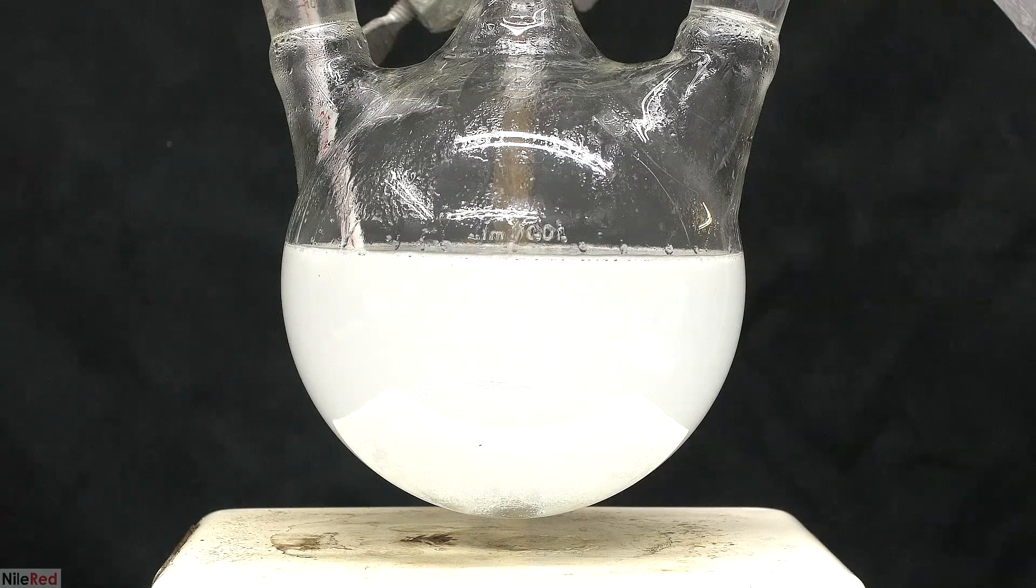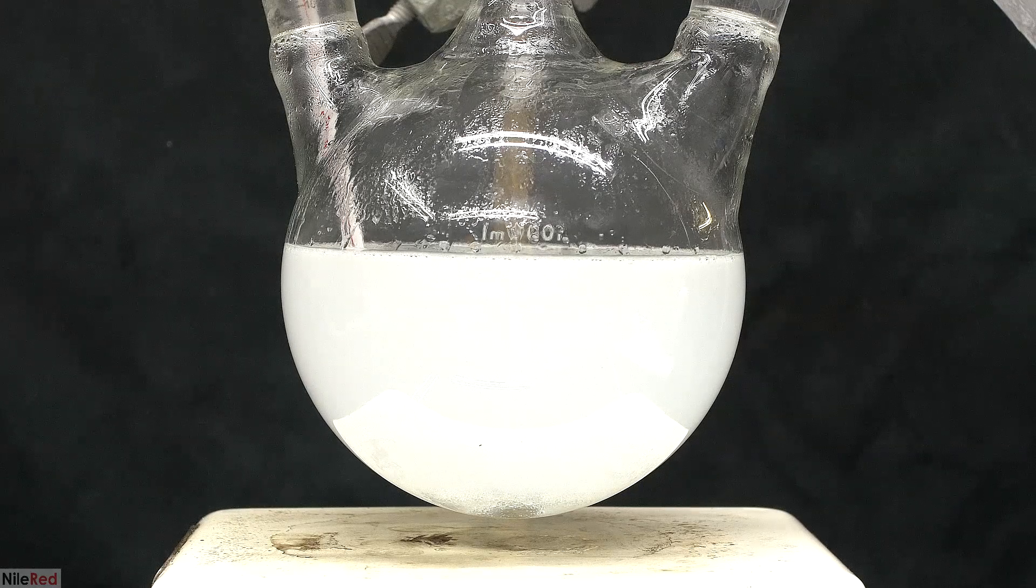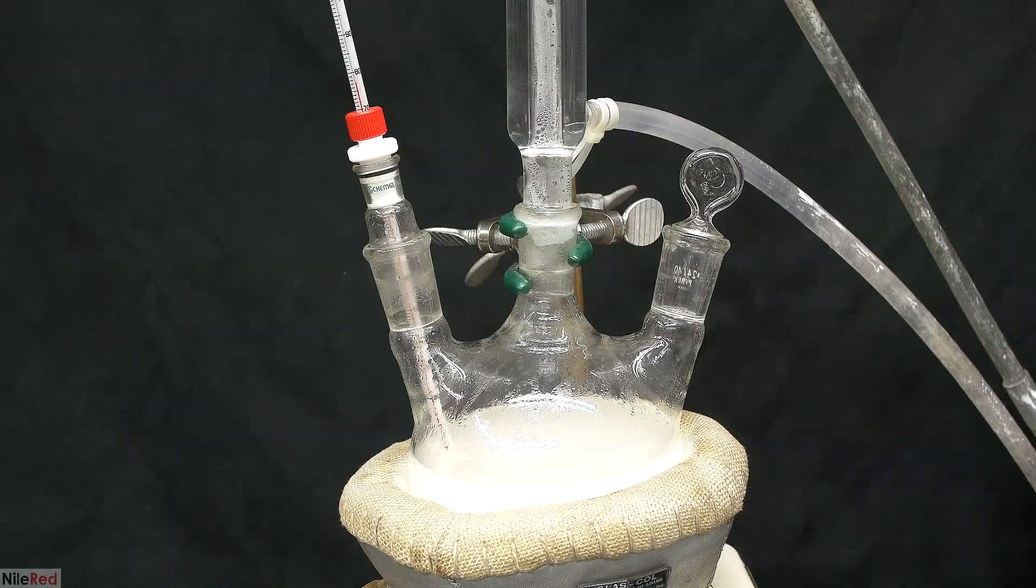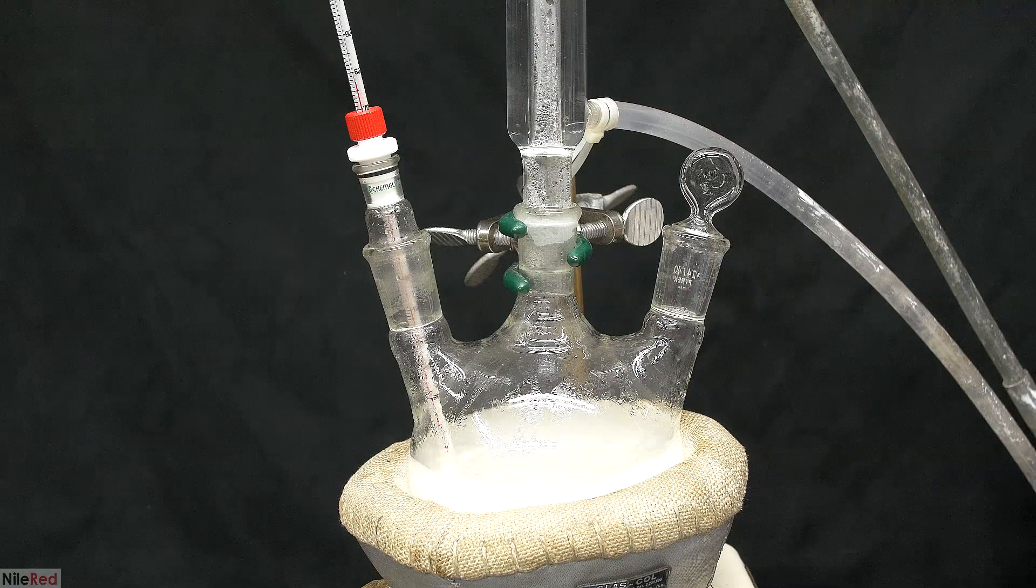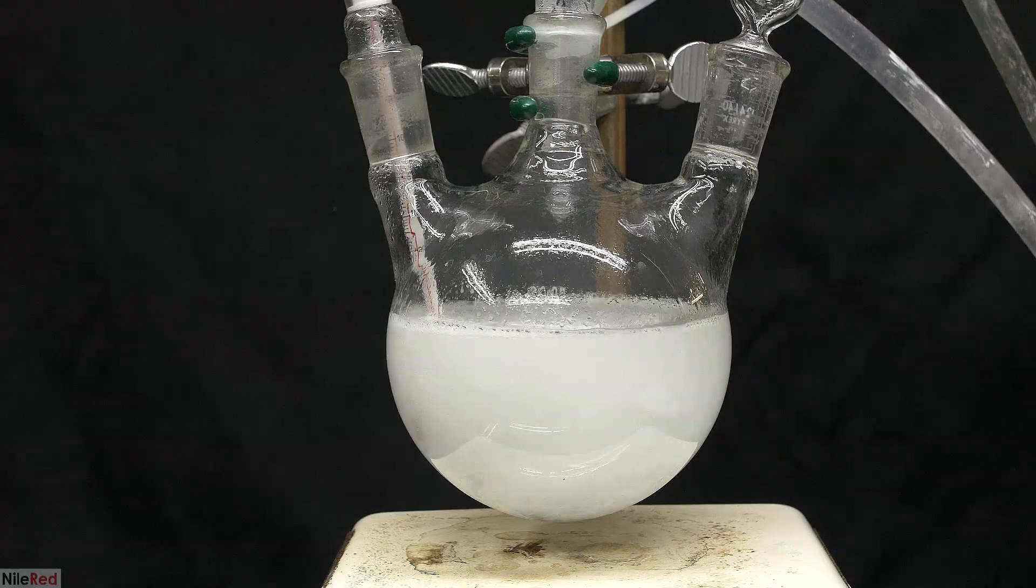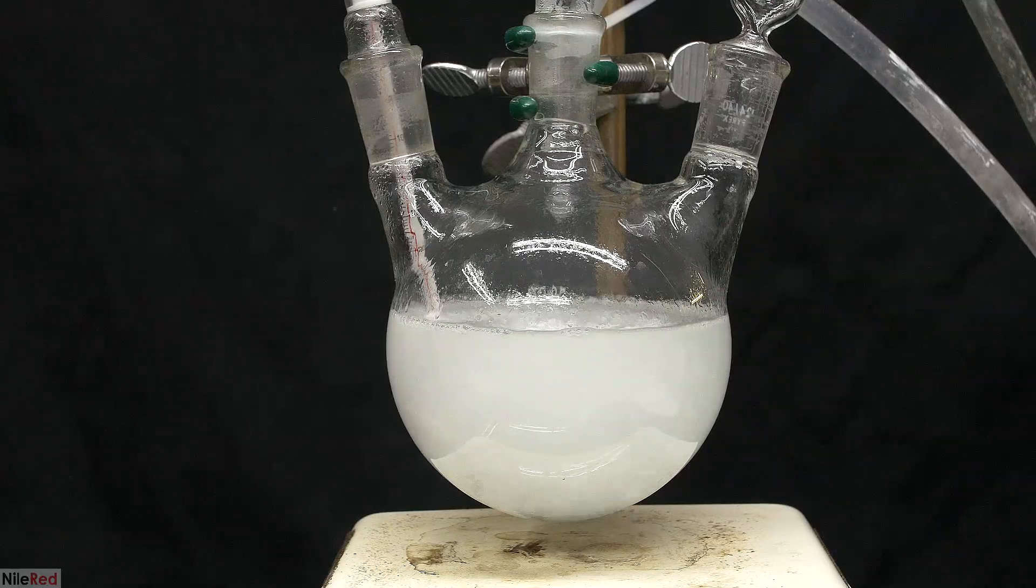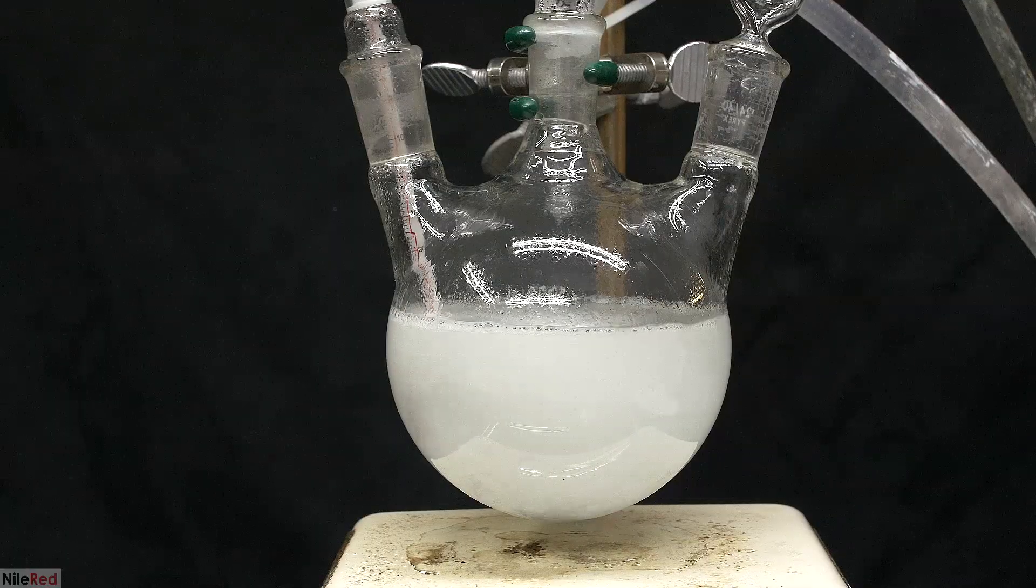When I stopped the stirring earlier, a layer of cyclohexanol formed at the top, but apparently that's all gone now. Because the temperature was dropping, I put the heating mantle back on, and I started to heat things again. I really thought that the bulk of the reaction was over, but once I got to around 85 to 90C, the reaction took off again.